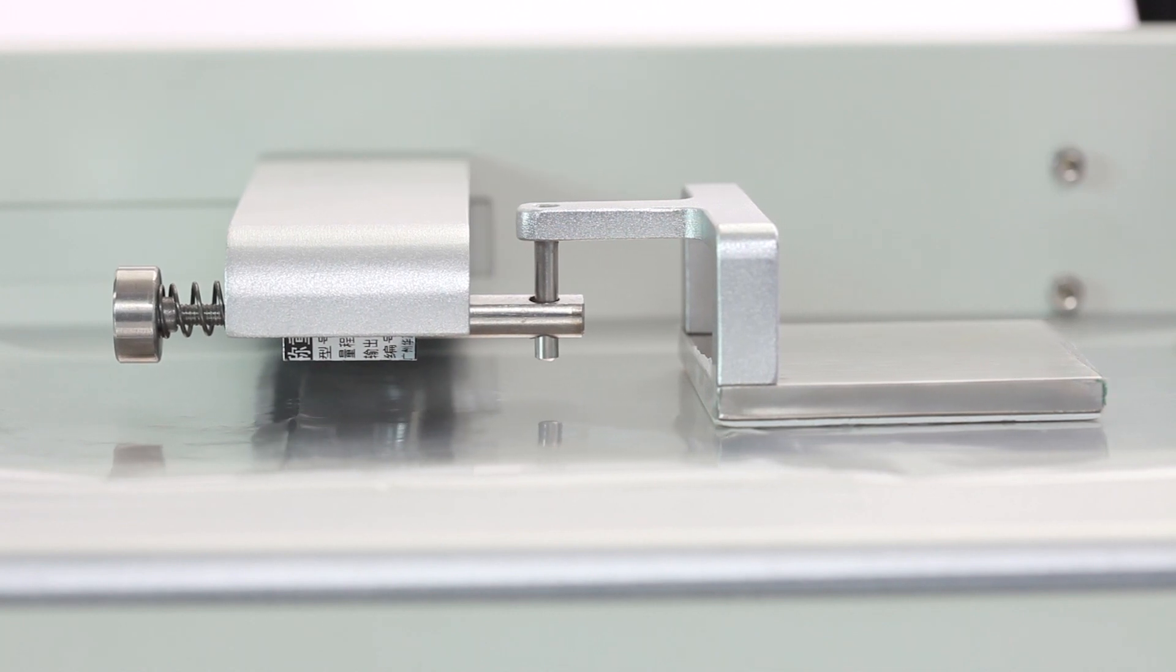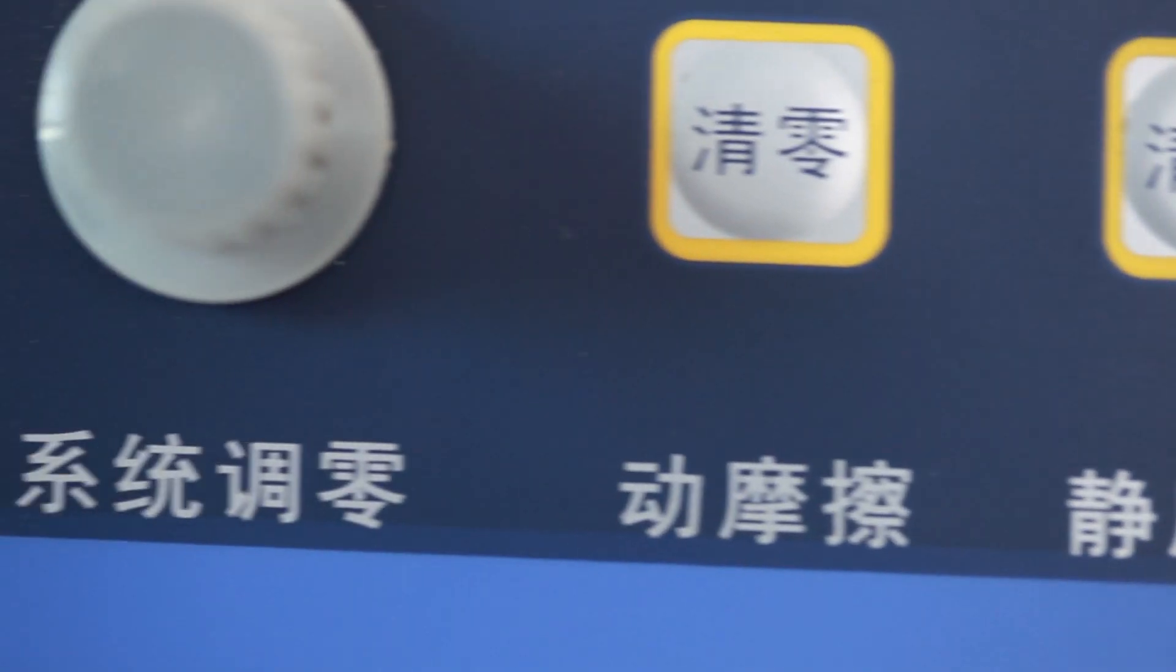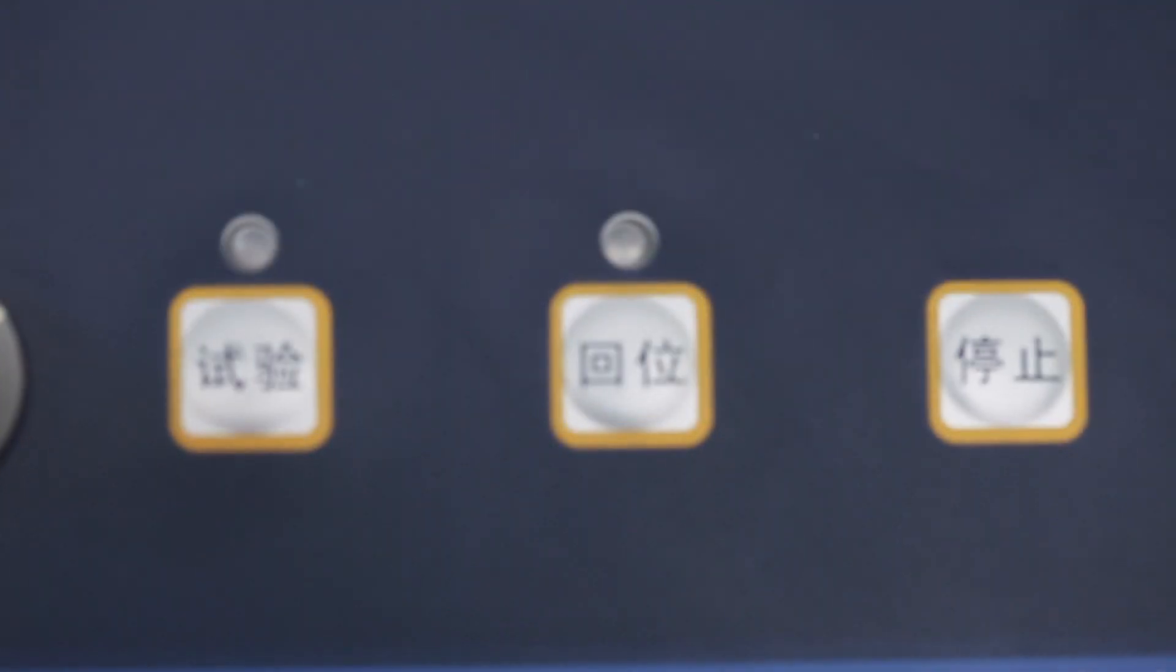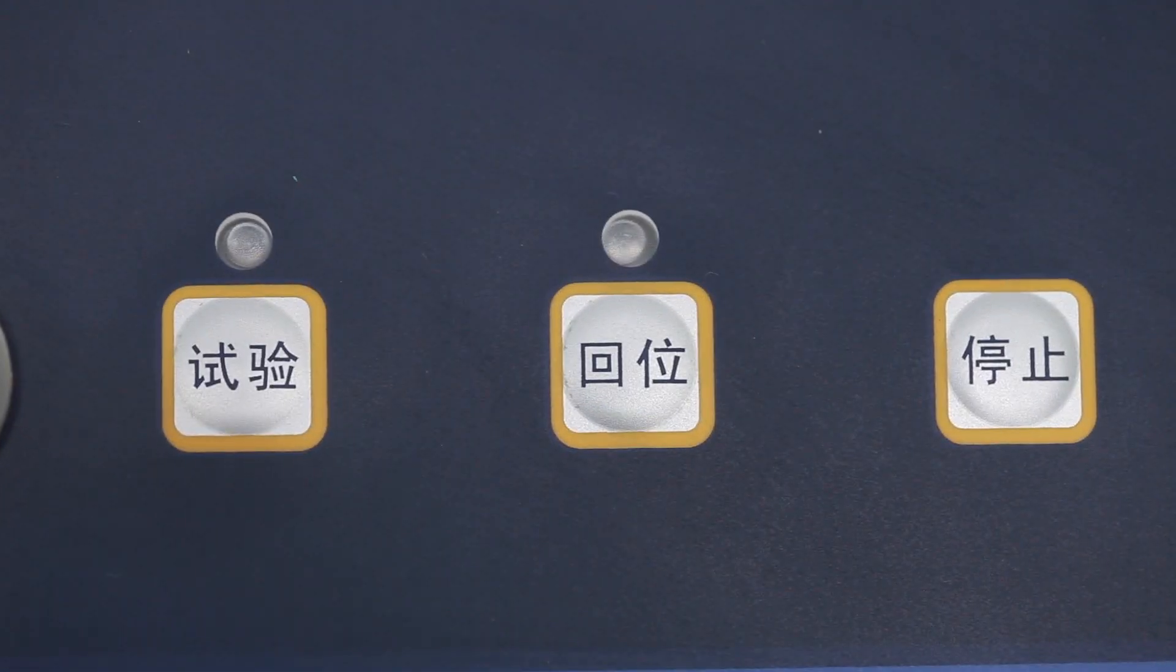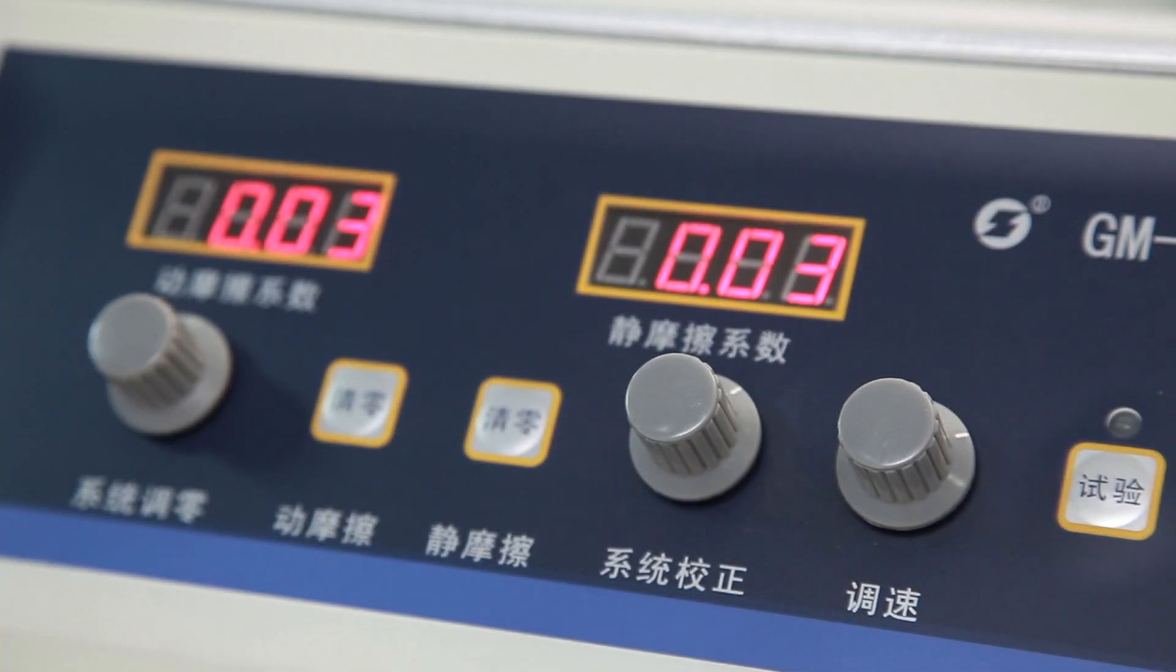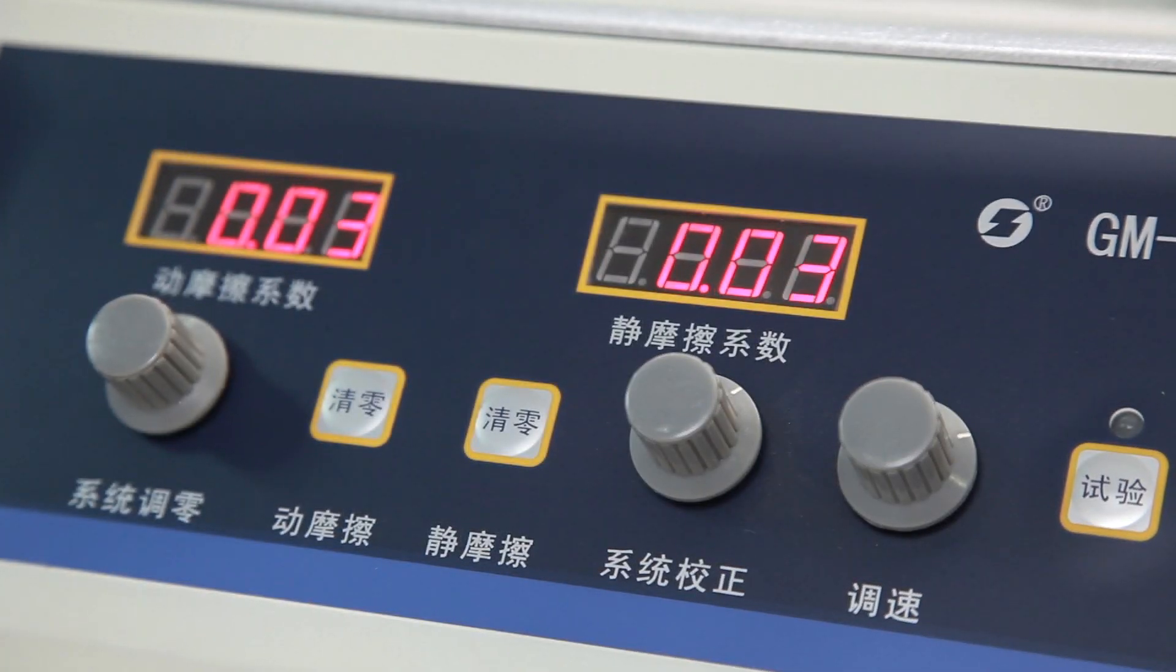Inspection agency and so on. It has excellent stability and repeatability, high precision, easy to use.